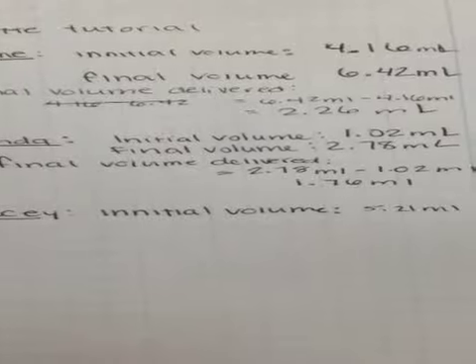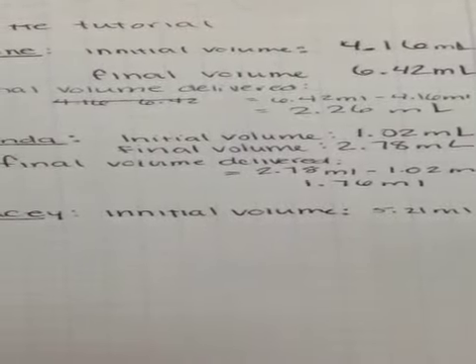Now you read it at the bottom of the meniscus. At the bottom of the meniscus it is at 5.21. The initial volume is 5.21 milliliters.